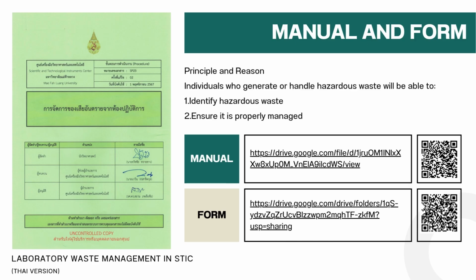To help you follow correct procedures, STIC provides a detailed manual and online forms. These guide you step by step on how to register waste, label it, store it, and request transportation. Whenever you handle hazardous waste, always check the manual to ensure you followed the official safety process.